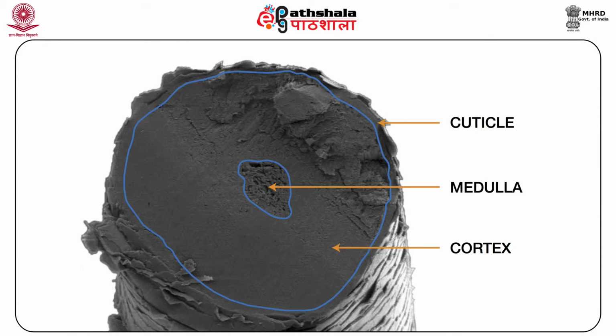Next, we will study about the microtomy. The cross sections of hairs are obtained with the help of an instrument called the microtome. Clean hair is embedded in hard wax, plastics or flesh hardened by the special treatment and sliced.